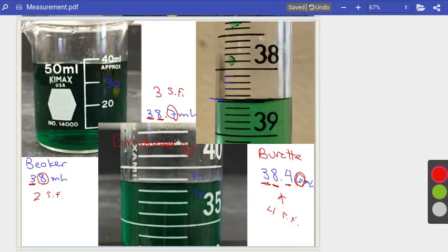So always and forever, more significant figures is better. But we can't just create them arbitrarily. That would be basically like lying about our data and the quality of it. We only get as many significant figures as we can get from the quality of our measuring devices.